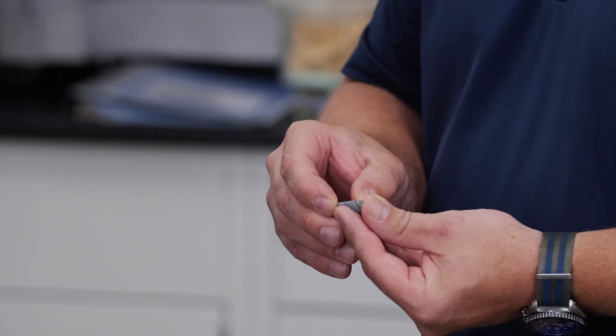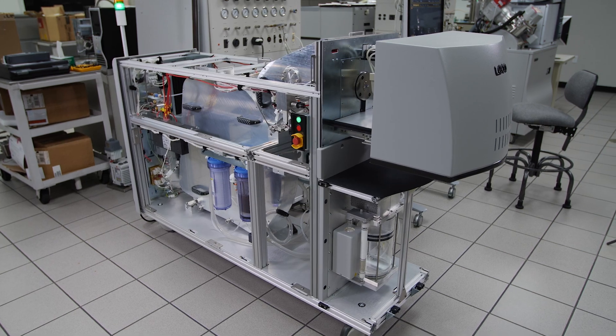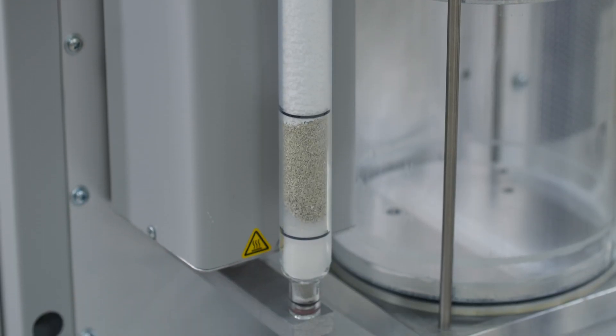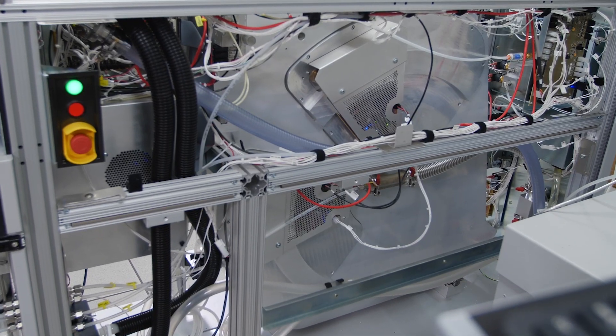As the industry leader in bulk elemental analysis, the GDS series is designed to handle anything you have to throw at it. Regardless of your sample type, your GDS will be designed, manufactured, tested, and fully calibrated in our factory in St. Joseph, Michigan, and delivered to your lab to immediately begin work on your applications.